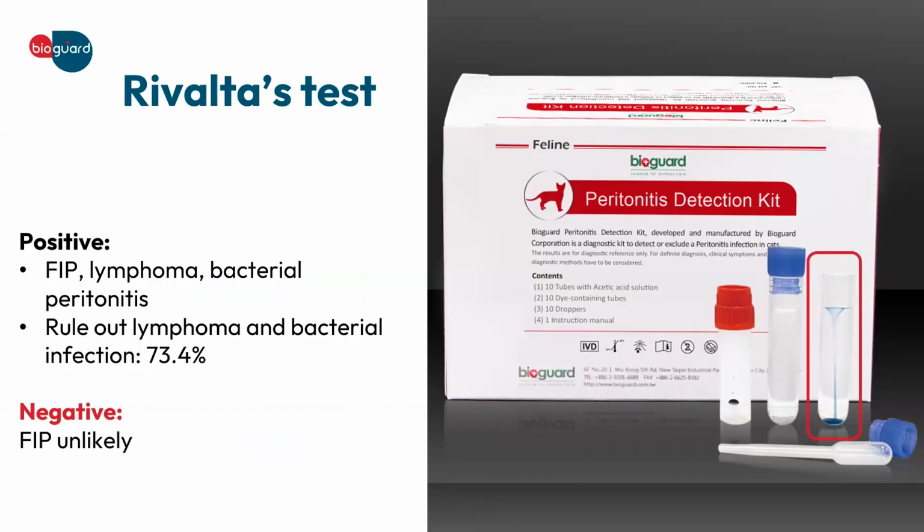it can tell you that it is either FIP, or it can be a lymphoma or bacterial peritonitis. However, it rules out lymphoma and bacterial infection by 73.4%, because the Rivalta test is very specific for the detection of FIP. If it's negative, then FIP is unlikely.